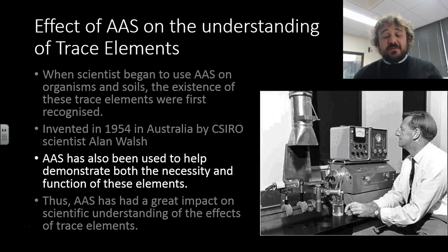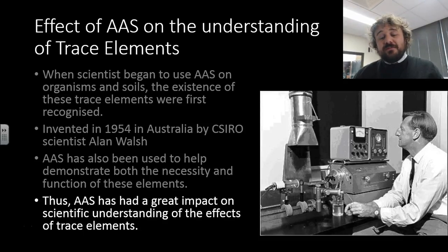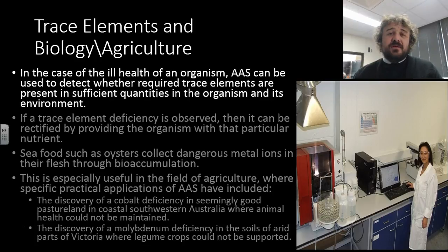It's been used to help demonstrate the necessity and the function of elements. And we do this by knowing, alright, so this is how much we have. If we take some out, this is what happens to the organism, and we can actually measure how much we're taking out and how much we're putting in there. So, because of this, AAS itself has had a great impact on our understanding of trace elements. So, in biology and agriculture, they've been really, really important.